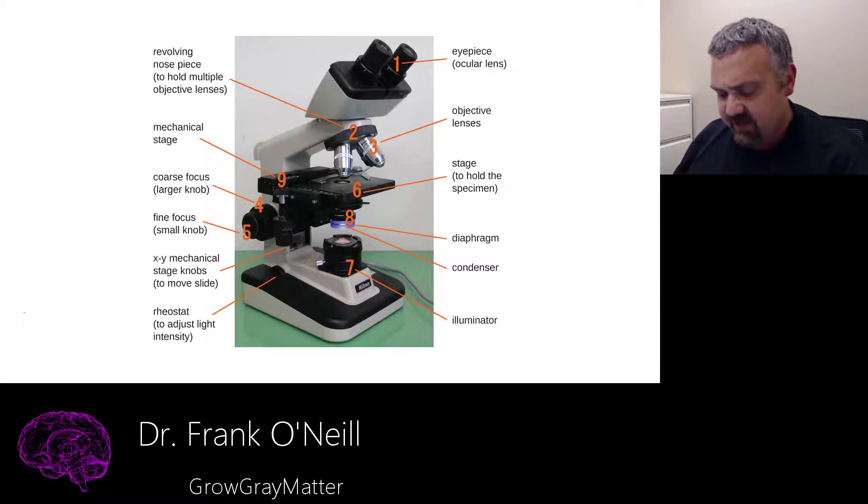Number six is the stage. That's where you're actually going to sit the specimen. It'll sit right here and be clamped in there by the lobster claw, as I like to call it.